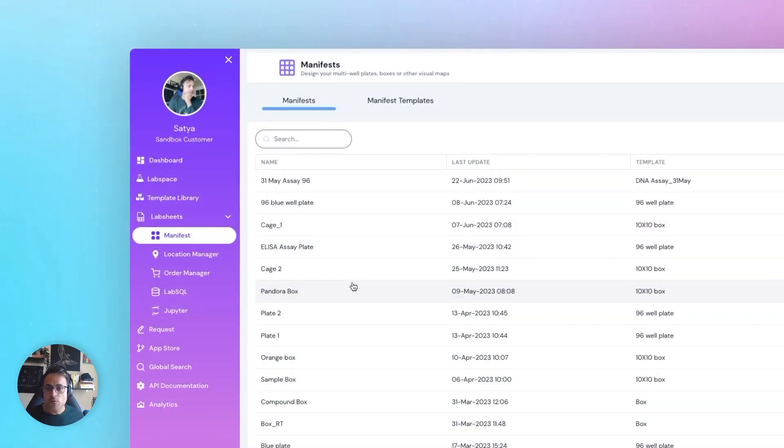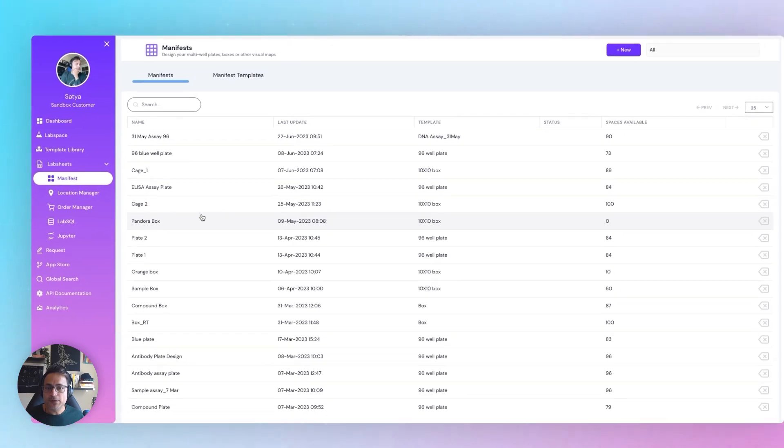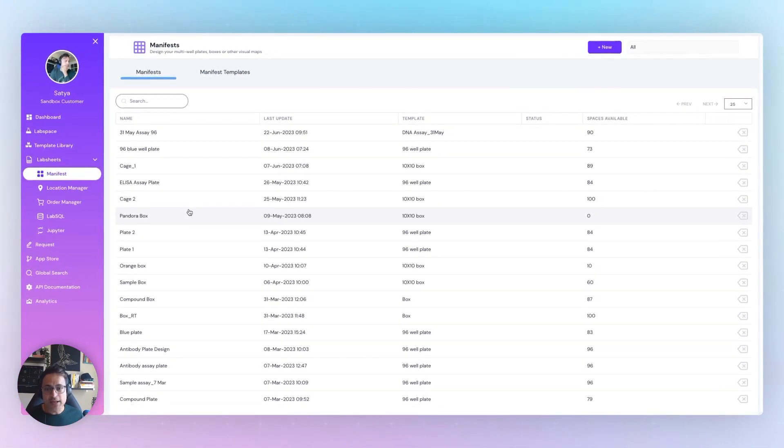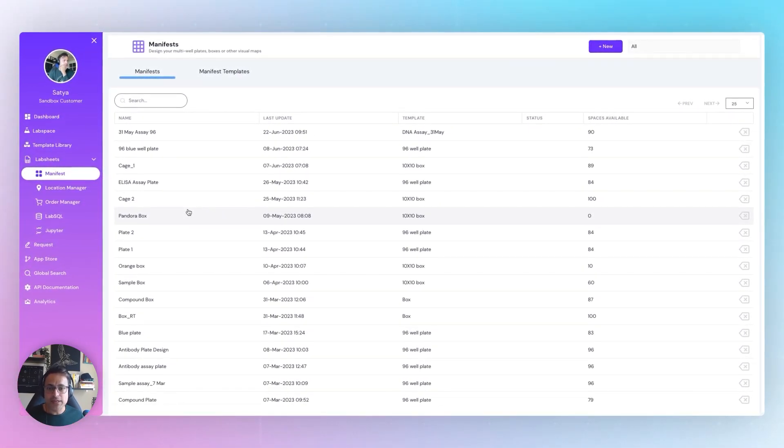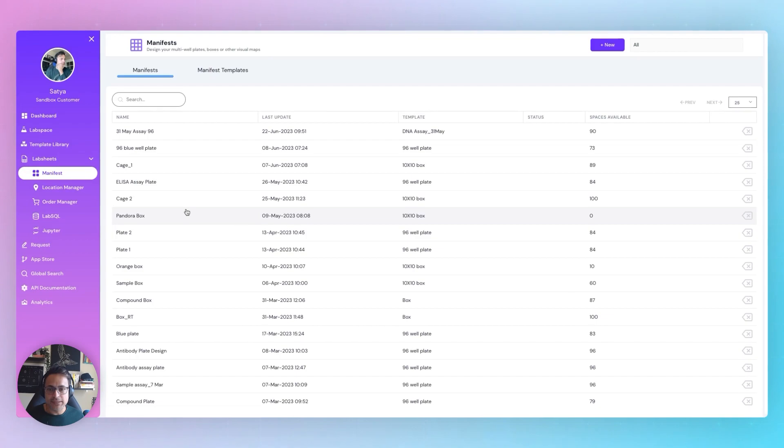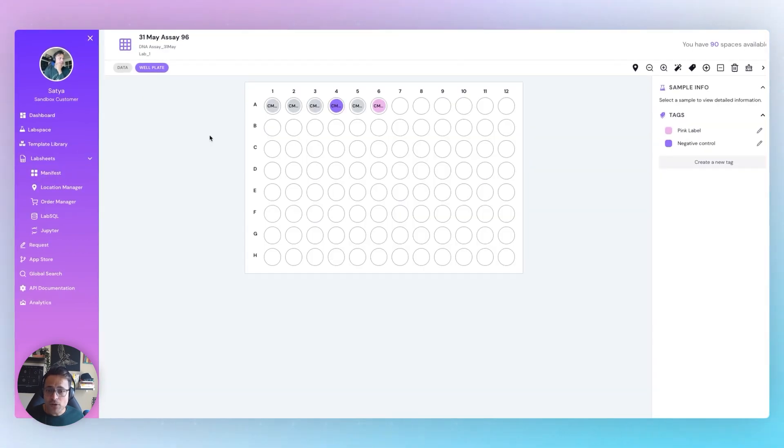With Manifest, visually map your lab from freezers and liquid nitrogen cylinders to racks and multi-well plates. But that's not all.